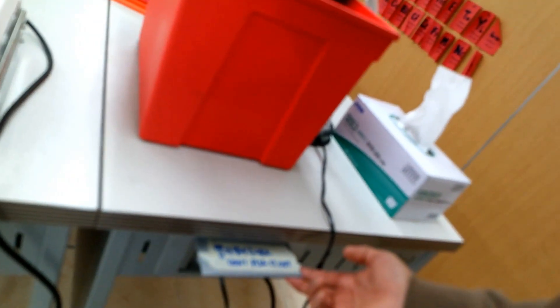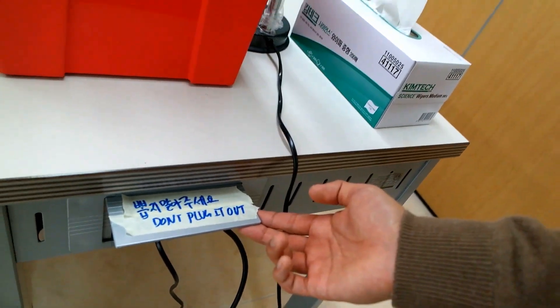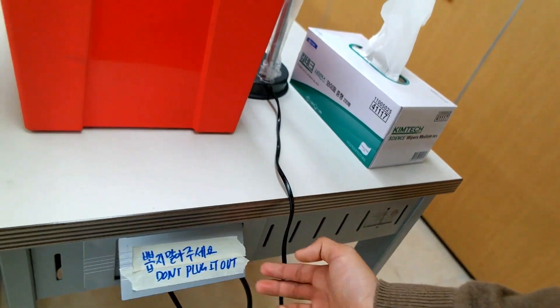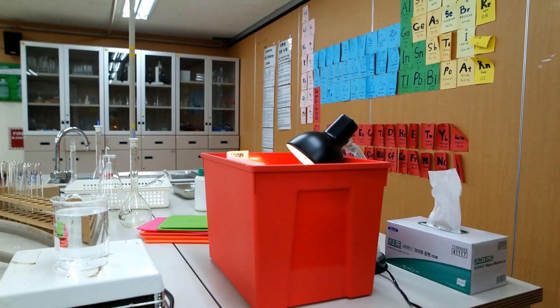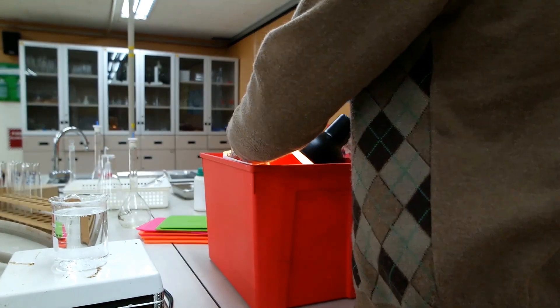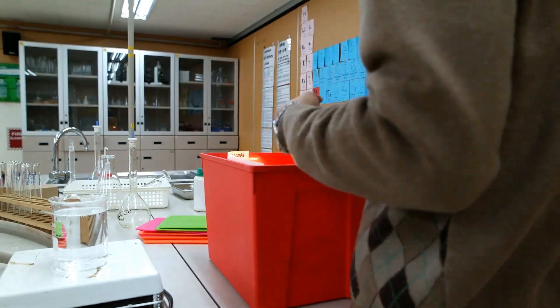That's why I made a sign saying don't plug it out. I hope it should be growing sporadically any moment now.